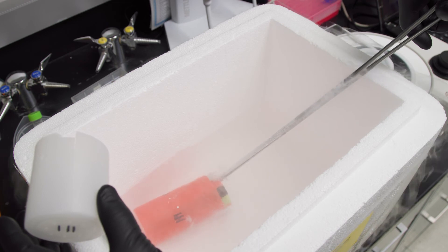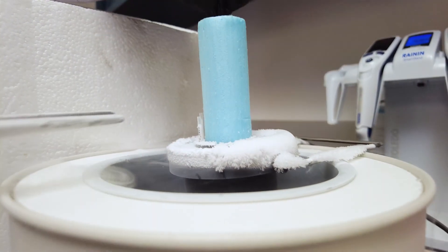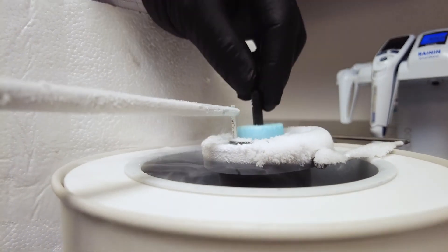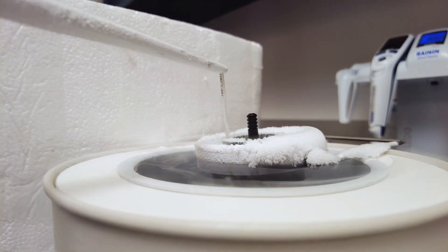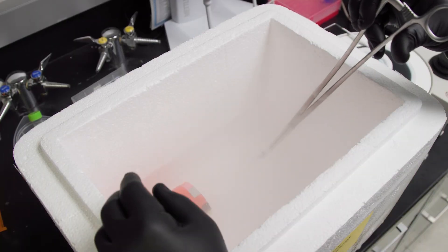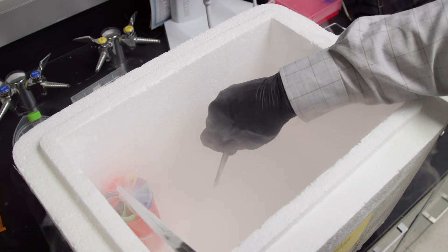Once the straws reach negative 40, they are rapidly transferred to the liquid nitrogen bath and packaged into the cryovials. It is important that once they are in the liquid nitrogen, they not be removed until thawing to prevent changes in temperature. Cotton is used to secure the straws in the cryovials to prevent them from floating out during transfer and storage.